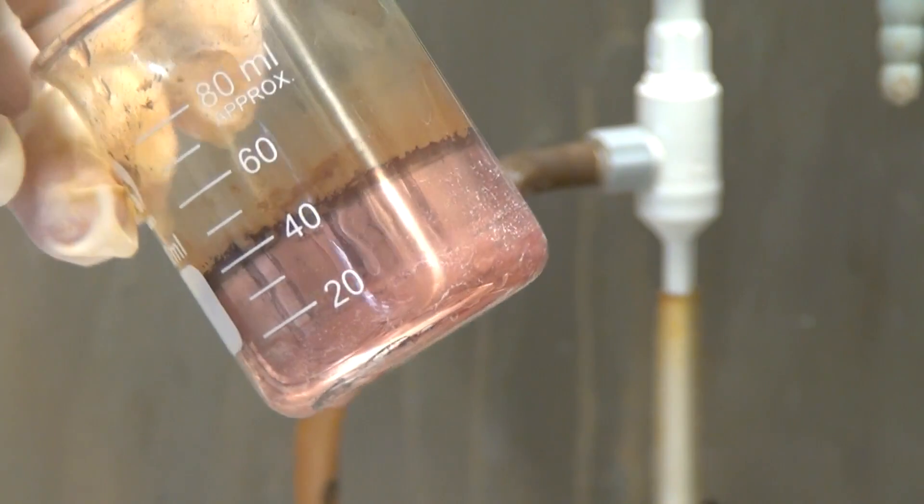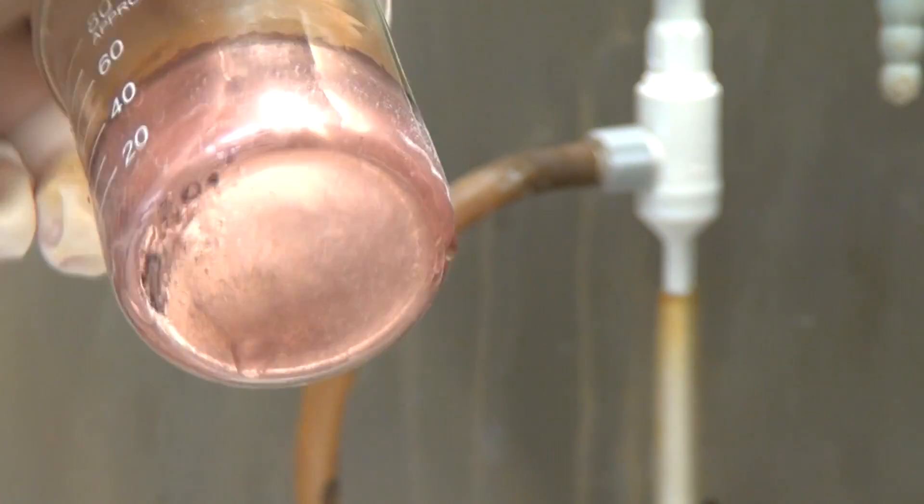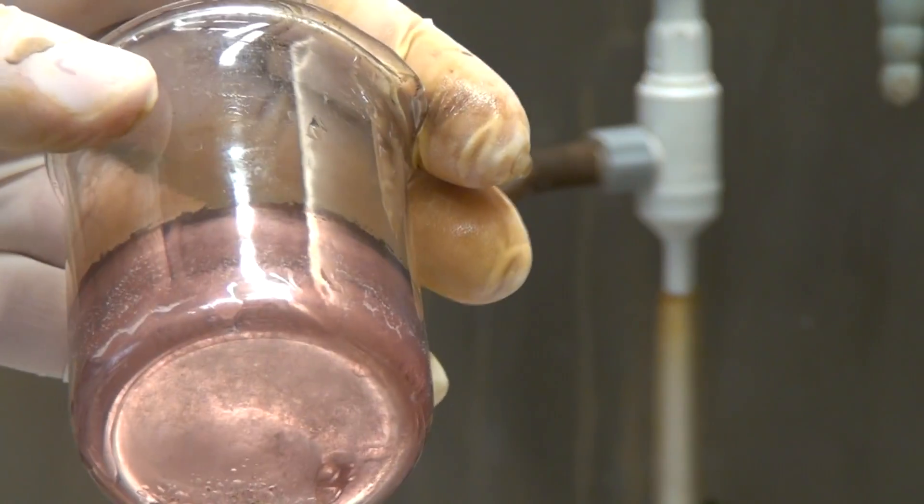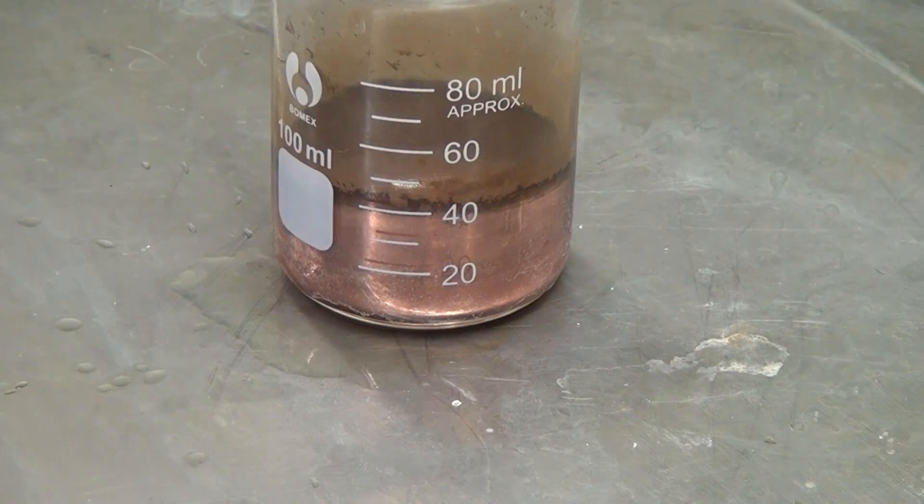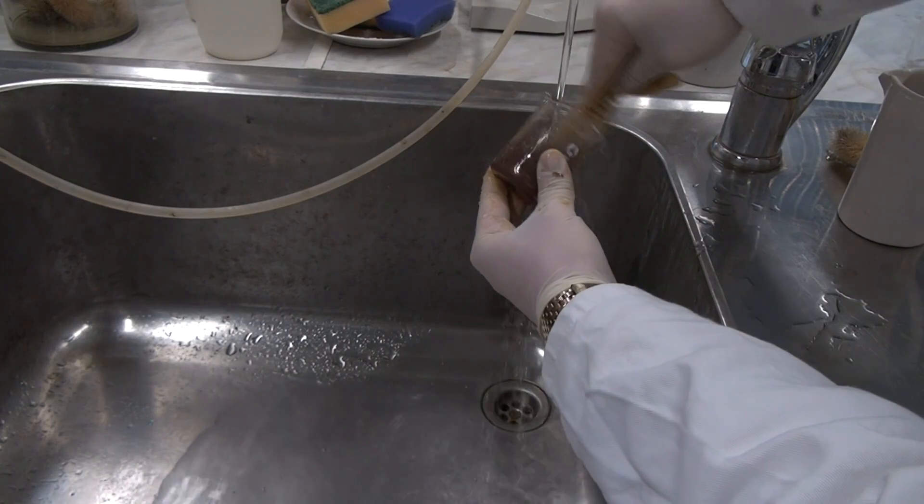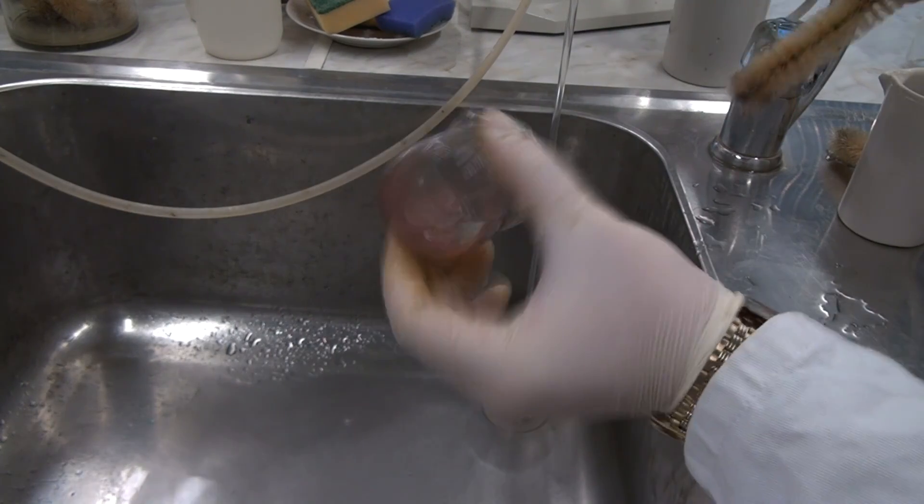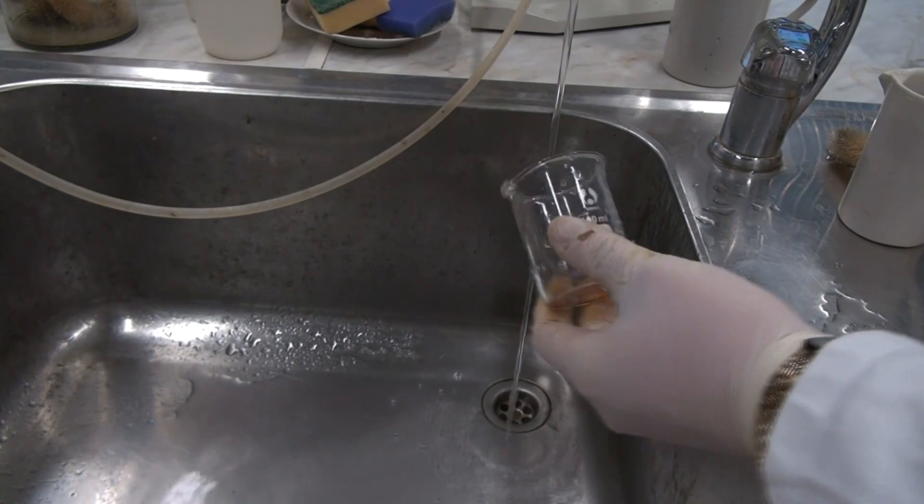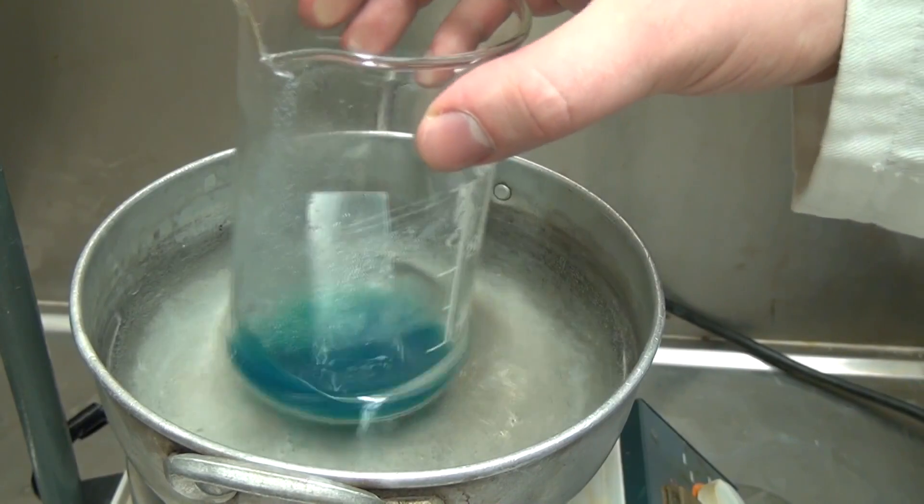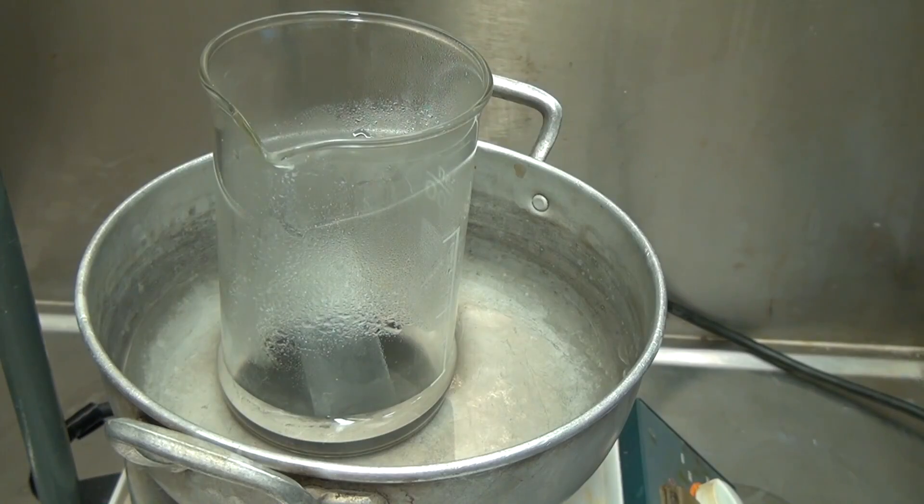The mirror resembles a silver mirror, the difference is that copper has a different color. However, the resulting layer of copper is quite fragile and can be easily washed off. Another method exists in which formaldehyde is used instead of hydrazine.